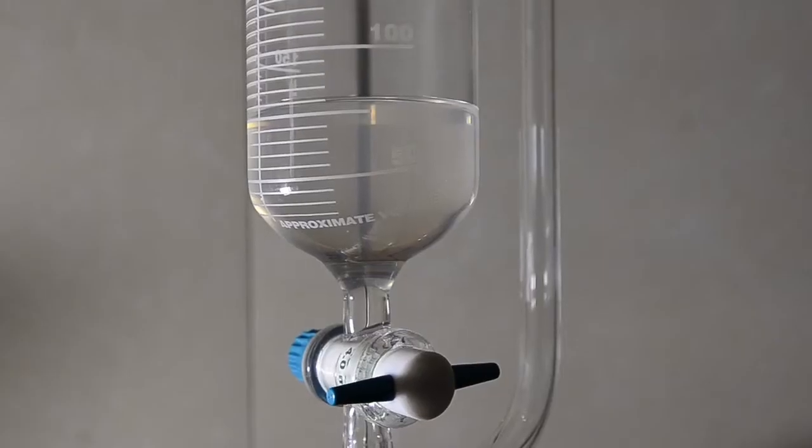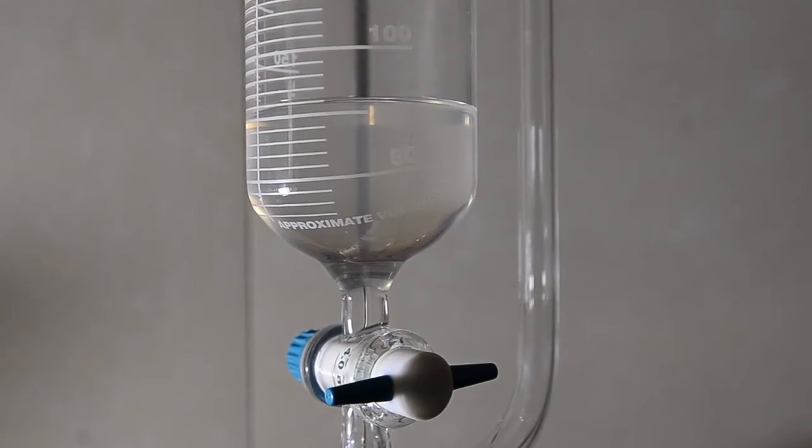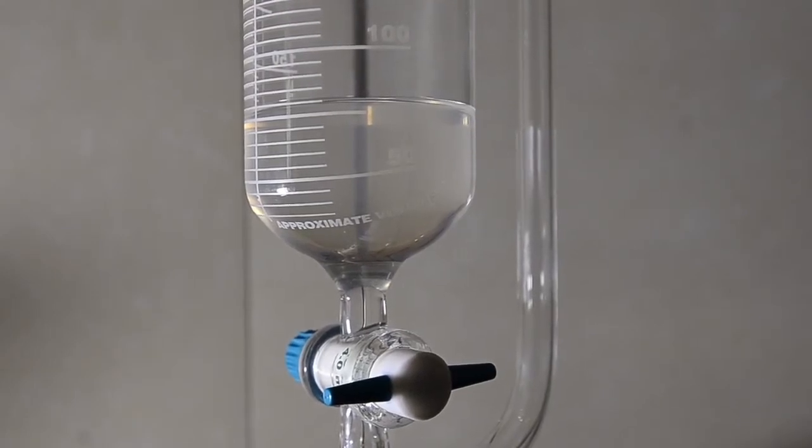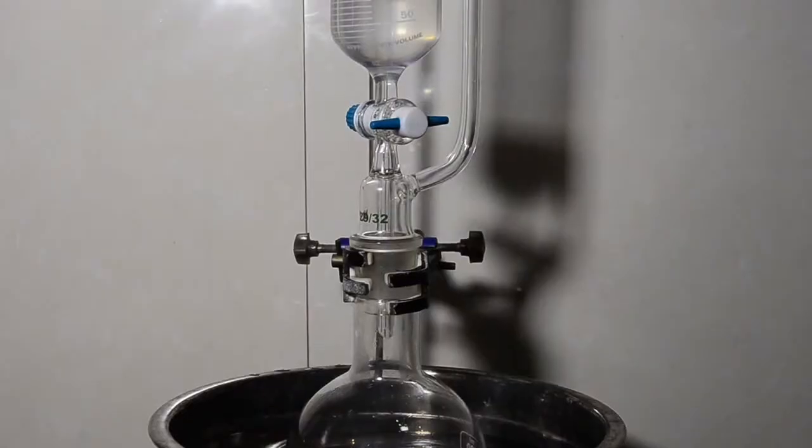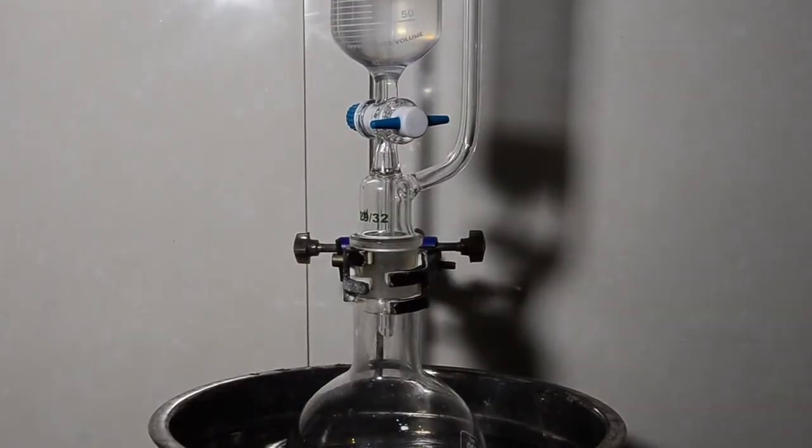Set up an addition funnel on top of the flask and add the phosphorus trichloride to it. You'll also need a way to vent the flask as a lot of HCl gas will be produced. I've used a pressure equalized funnel but you could use a multiple neck flask or other setup.